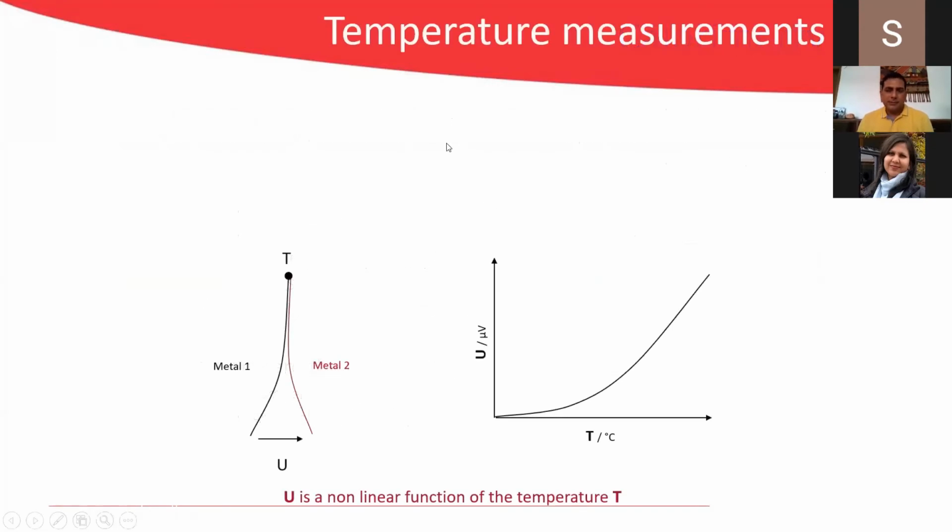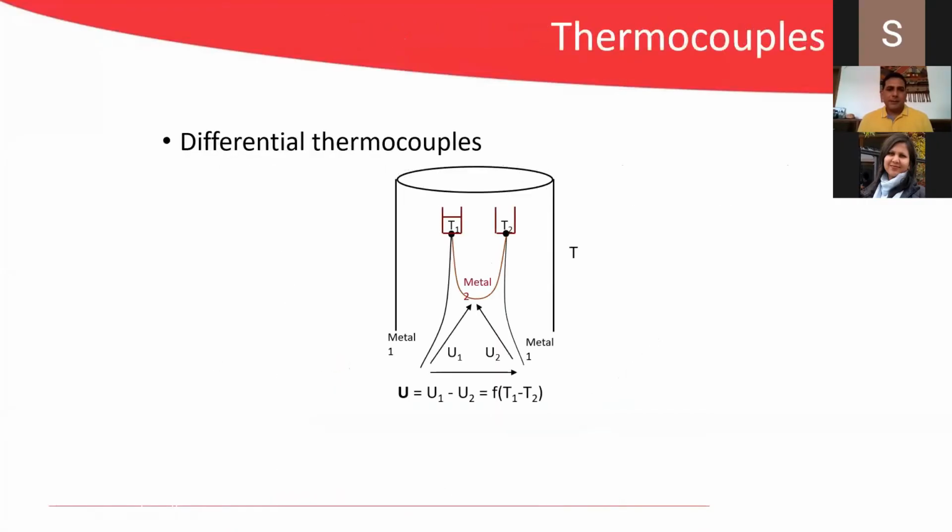Then these are some temperature measurement techniques. I don't want to discuss them, because you just need some thermocouples there. And what you do in DSC is measure a property with respect to change in temperature. Then the thermocouple part: in the case of the DSC, practically you have two pans, the sample and the reference material. So this is how your connections are in a DSC.